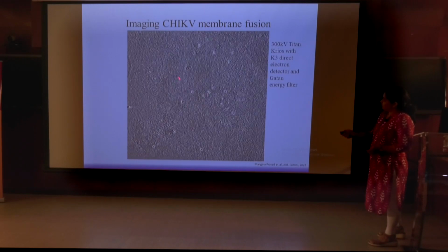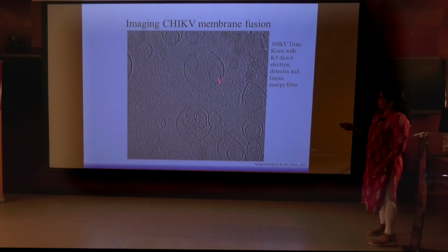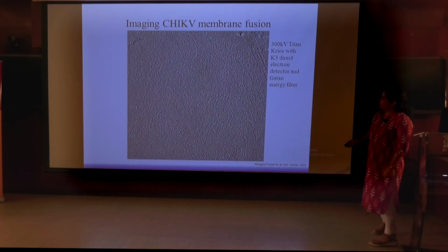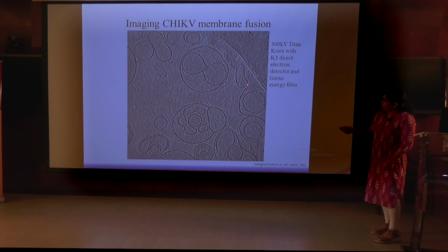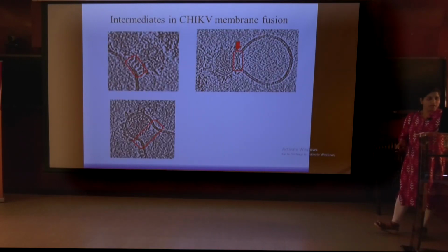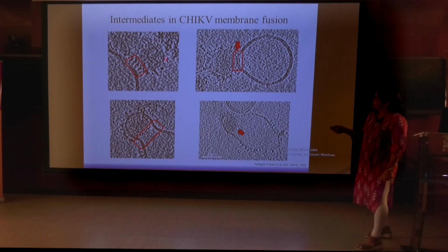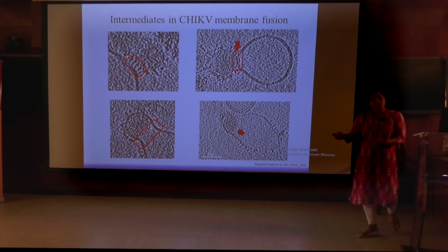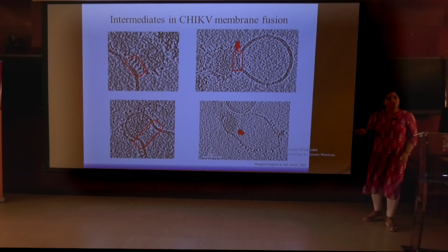So we have all these fuzzy particles, which are the virus. And you can actually look at them directly interacting with membrane mimics here, which are liposomes. You can zoom into each of their interactions, and you can actually understand how the virus is. And this is black as high density, and for some people who are not used to seeing that kind of image, it can literally look very grainy.